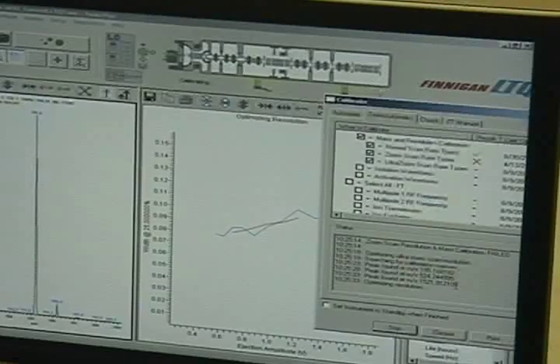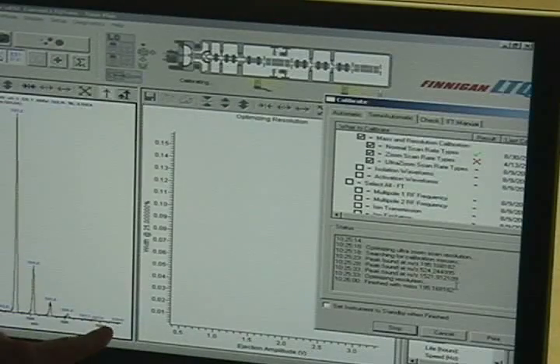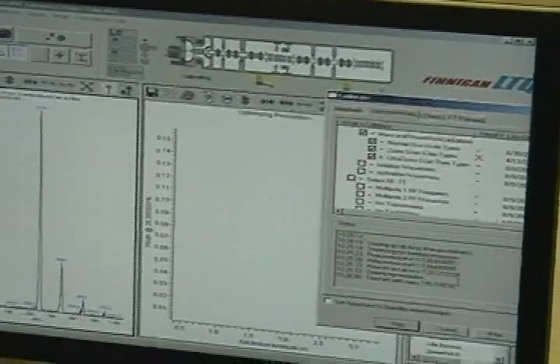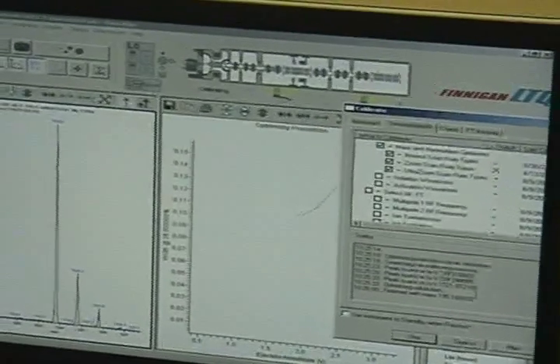And what's the AMU per second on ultra zoom? 28. So this is substantially slower. And it's actually only acquiring data in a very small range of mass. That's the full thing that it's actually acquiring. With an FT, all these things are sort of, so.